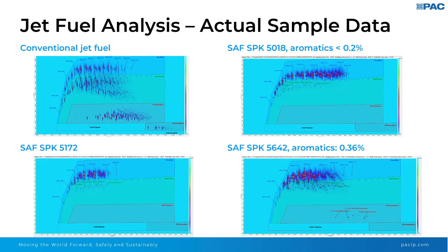For this data, the data acquisition is done by OpenLab CDS, but the data is too messy that you will require additional software for data processing called GC Image. So this data is actually from GC Image. In short, GC by GC is an excellent solution for individual hydrocarbon analysis at percent level.